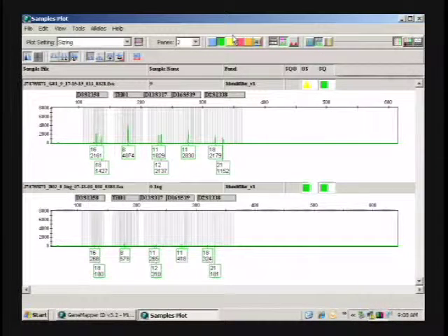So like we were saying yesterday with the whole validation, when you all are validating this, you don't have to add all your volume. This data is actually very good. This is better than what I had seen originally when I had only added the 1 microliter. I was only seeing like a fourfold increase or something like that. This is probably maybe 7 or 8, you know what I mean? So it's actually very good.